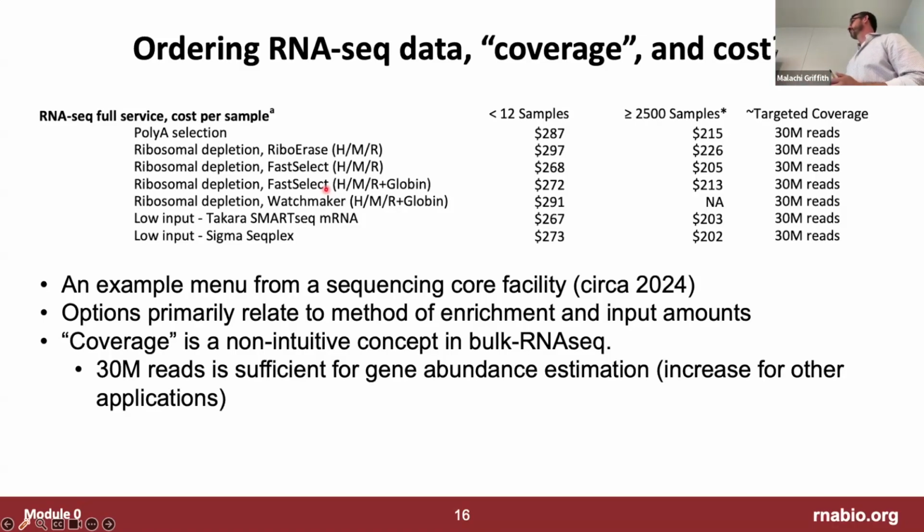Generally speaking, I think the answer is no, as long as the input amount, like the number of nanograms of RNA that you sample from that whole prep, gives you a good molecular sampling of the diversity of transcript molecules in there. Which it generally will if you follow the recommendations of the sequence data generation place that says give us 250 nanograms. That estimate assumes that there's a lot of molecules in those 250 nanograms, and it's going to capture most of what you're interested in, unless you're interested in some really rare species.